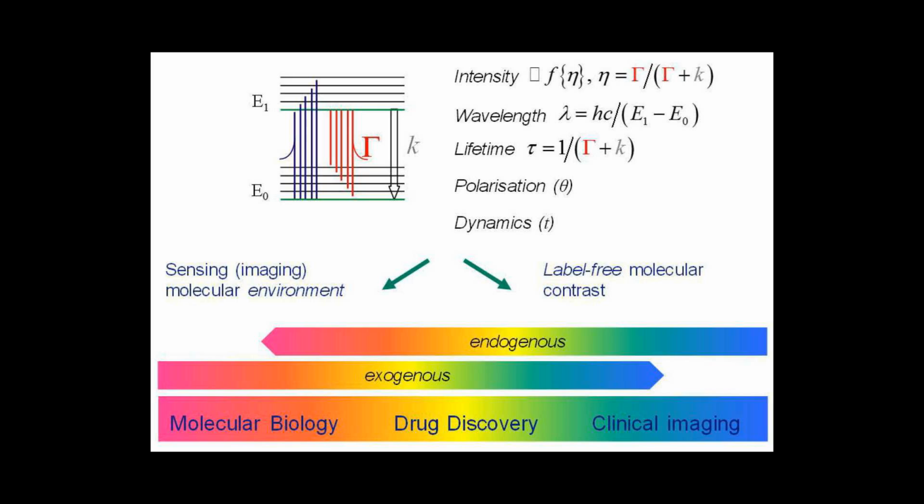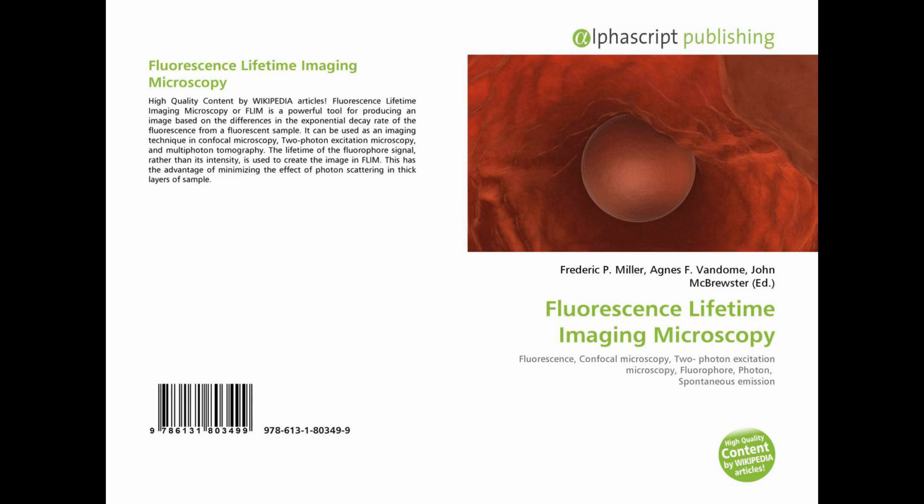The instrumental response function, IRF(t), will be convolved or blended with the decay function, f(t): d(t) = IRF(t) * f(t).